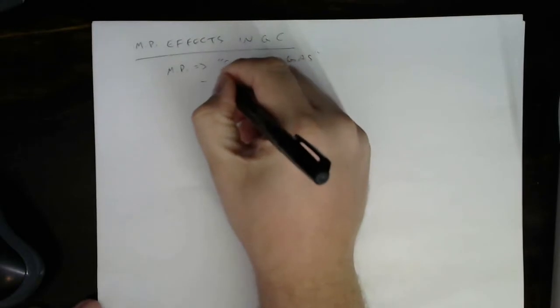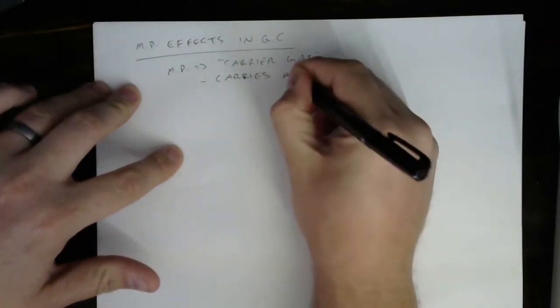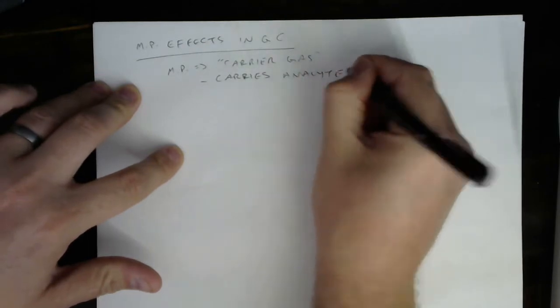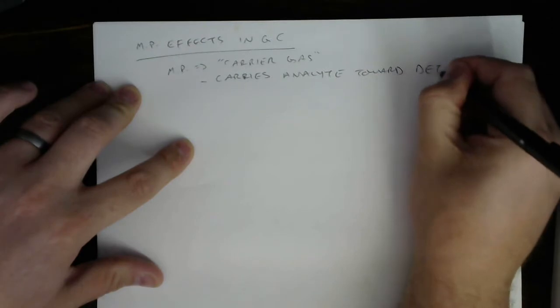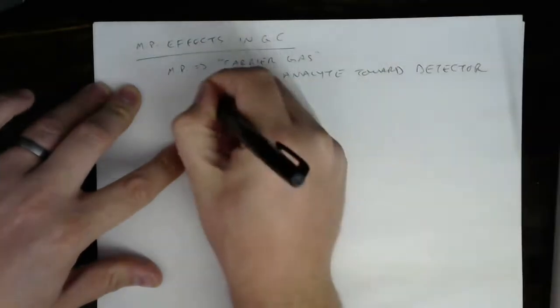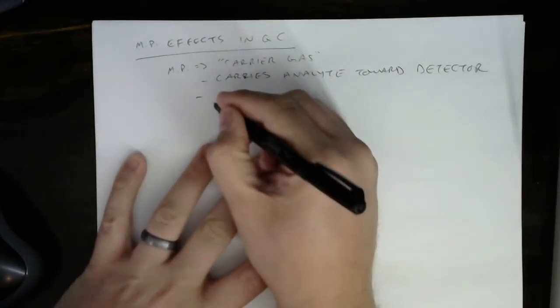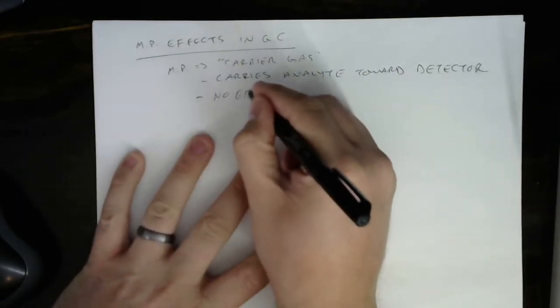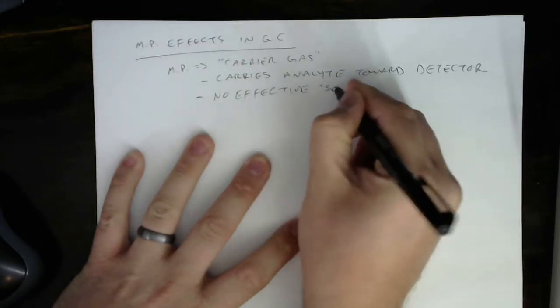All it does is carry the analyte toward the detector. That is to say, it effectively has no effective solvating power.